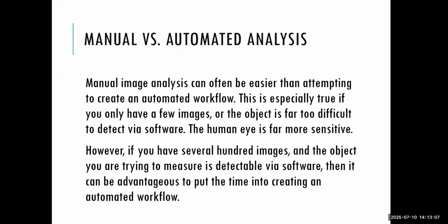So manual versus automated analysis. Manual analysis can often be easier than attempting to create an automatic workflow. And it's fine if you've got a few images, or if the object is far too difficult to detect via software. Sometimes you get an image which the software just would not have a hope in hell of being able to do anything with. If you've got an overly confluent image of cells, or things are just not well resolved enough for the computer to actually do anything.